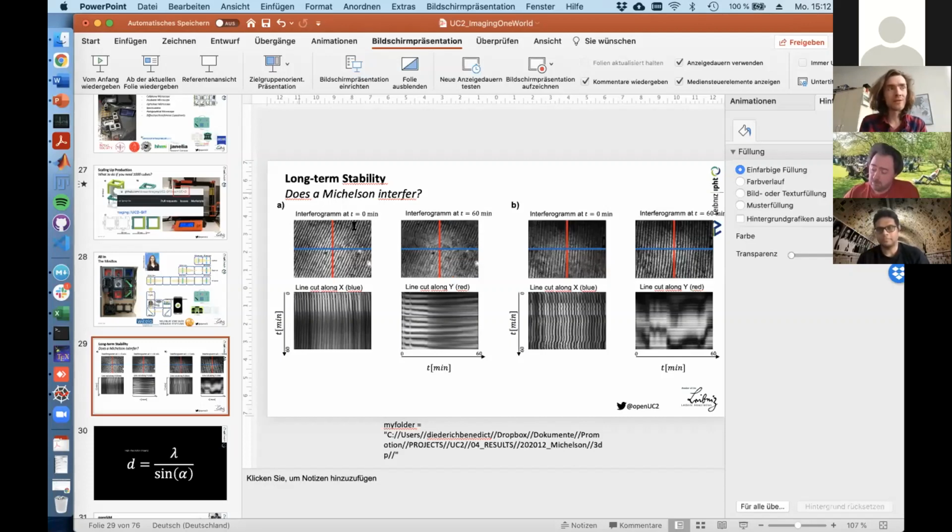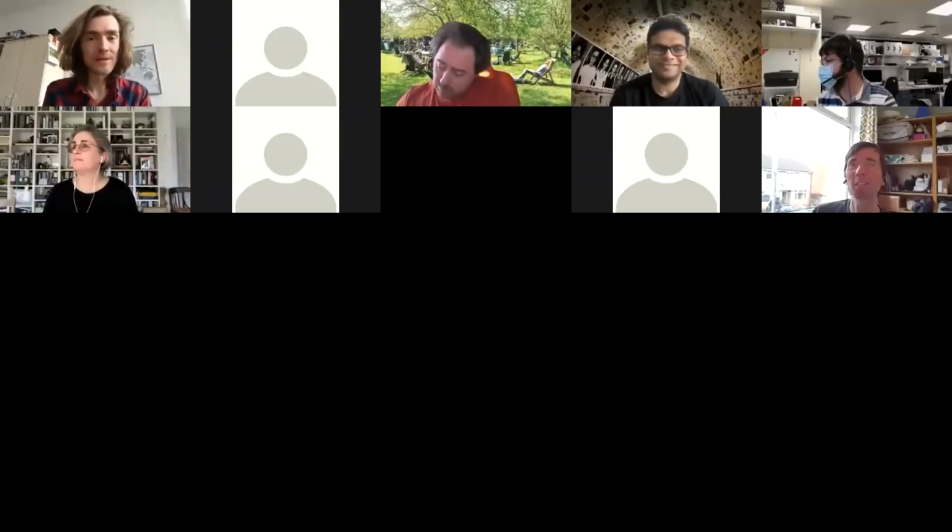But I think if you, for example, want to control motion linearly, you can really nicely use these voice coil motors from CD drives. They are usually quite linear with this tilting, but for mirrors it shouldn't matter too much, if this is what you meant. Yeah, okay. No, that's an interesting actuator to play with. I've not played with the voice coils. I've never figured out how to do the drive electronics side of that, but I should probably look at your documentation. It's really just PWM with some LED buck driver. Oh, cool. Yeah. And ESPs work better than Arduinos because they have higher carrier frequencies.